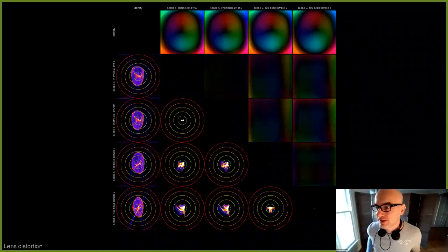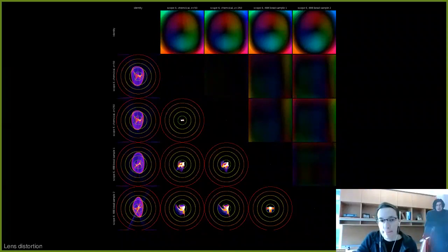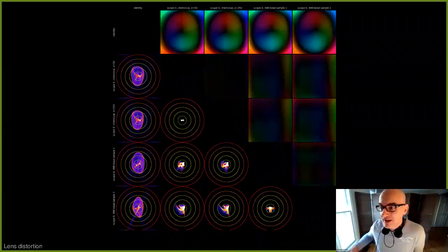No. We look just at the estimated model. We don't know what the correct lens distortion is. This is an estimated lens distortion. Okay. Yeah. Right. Since I don't have ground truth, one could probably get a ground truth from a calibration grid. But I'm not sure if this would be much better than this one, because you would have to be very precise in localizing these cross points to get to the precision that you reach with this.